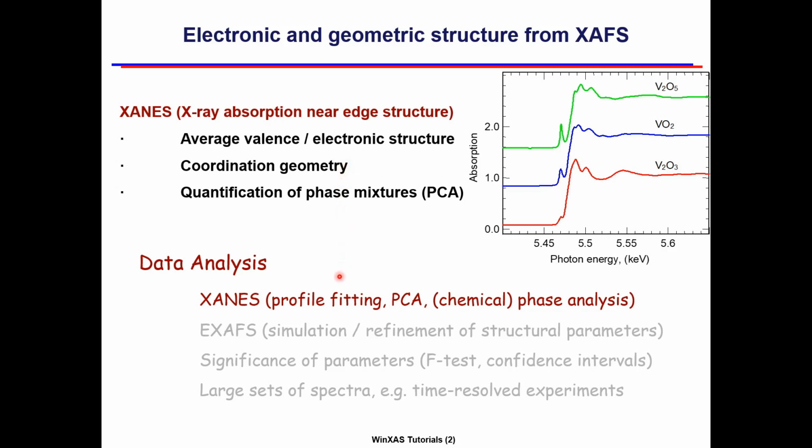XANES data analysis includes procedures like calculating derivatives, refining a sum of a step and profile functions to the spectrum, and principal component analysis. This tutorial covers the former, while the latter will be the subject of another tutorial.